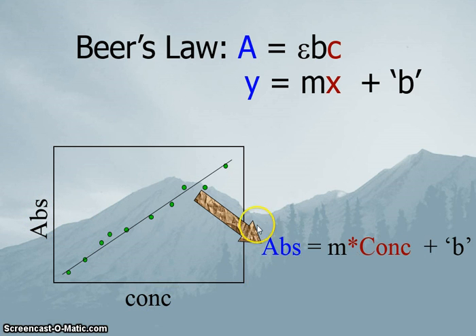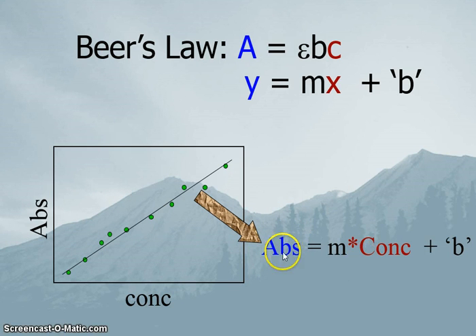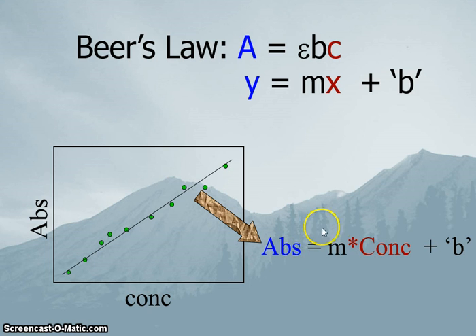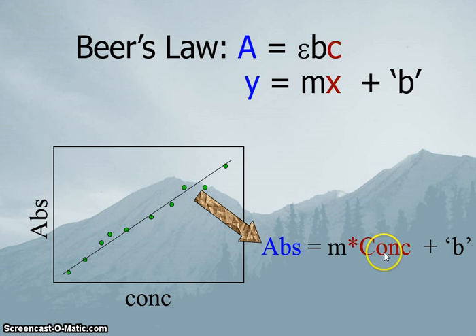This will allow us to measure the absorbance of our soda sample. Knowing the mathematical relationship between absorbance and concentration, we take the absorbance of our soda sample and calculate its concentration. That concentration of our soda sample is our goal for the day — very similar to the sugar and soda lab we did a couple weeks ago.